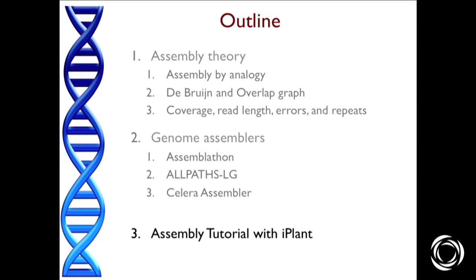Before we transition, are there any questions? Yes? What are the error rates for the molecular sequencing? So for the assembled sequences, the base sequencing is the HiSeq 2500, which is less than 1%.